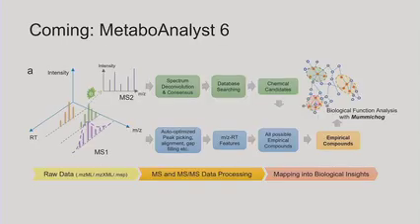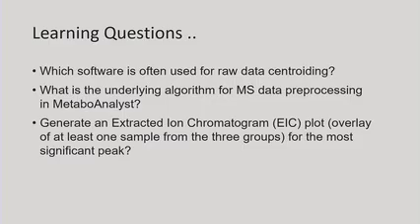So I finished the demo. So for our coming version, MetaboAnalyst 6.0, we are going to include another dimension for the raw spectral data, MS2. We will provide more functions, so we can see it next year. So I will give you some learning questions in the coming maybe 12 or 20 minutes for learning.